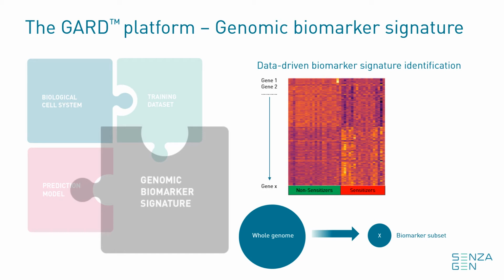In contrast to the traditional approach where one often measures a single biomarker based on previous experience, this holistic approach is completely data-driven and unbiased. It provides us the opportunity to see the bigger picture of how the cells react to different chemicals, and it identifies novel predictive biomarkers for sensitization.